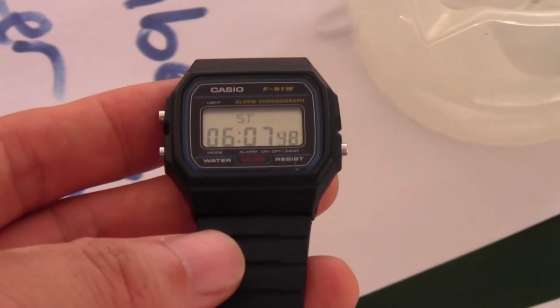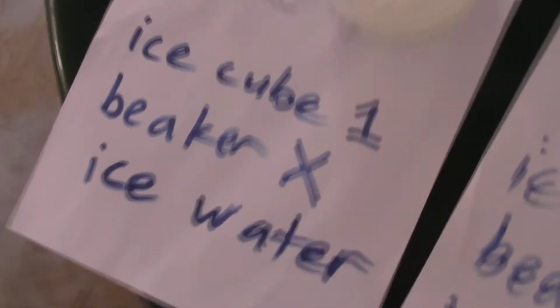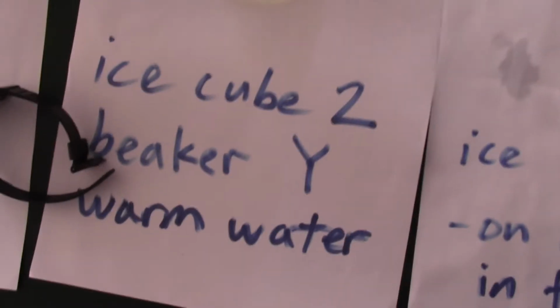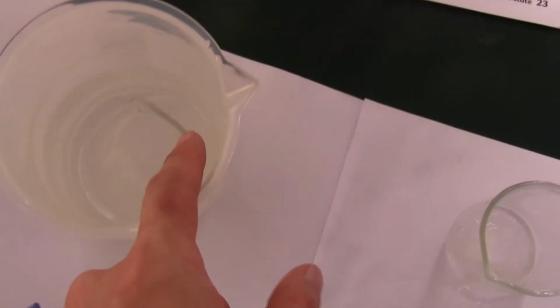The time now is just gone past 6 minutes. Let's have a look at how our ice cubes are doing. First one, ice cube 1 in beaker X with the ice water. Is it still there? Yes, you can see the ice cube is still there. Now ice cube 2 in beaker Y with the warm water. That one melted in under 2 minutes, so it's still water there. It's becoming warm water itself.